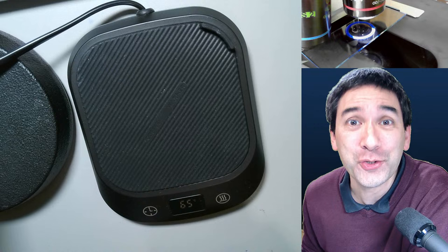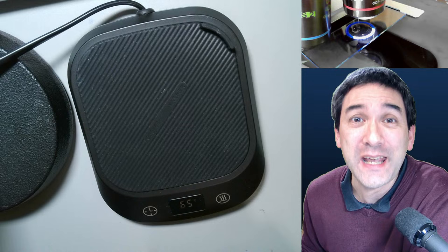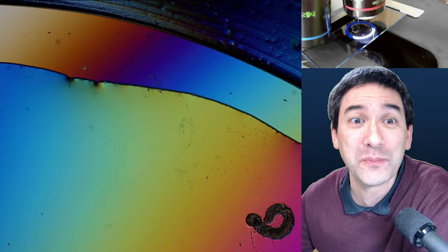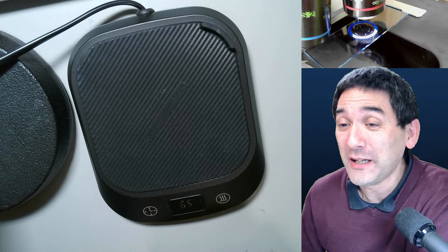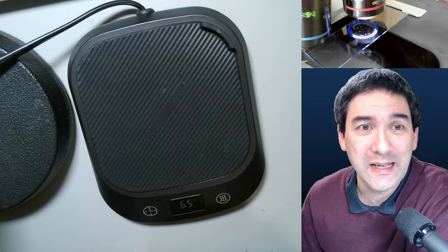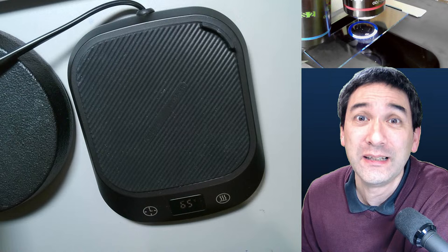I would like to show you some submissions from my viewers, because some of you have sent me pictures and videos of things you've created for hobby microscopy. I'd like to share them with you. There's always the danger things can become a little technical, so later on I'm also going to show you a few worms and how some of these tools can be used to observe them. Maybe I'll also feed them a little bit with some yeast.